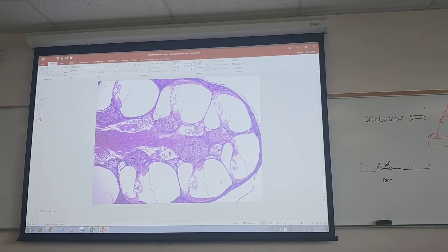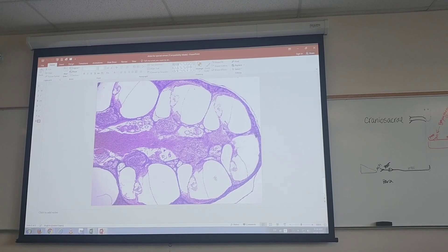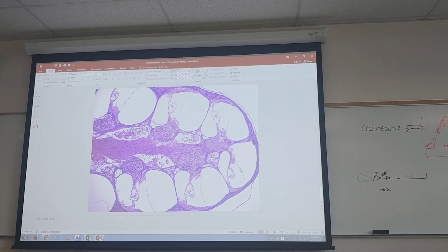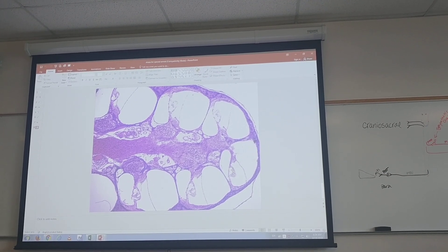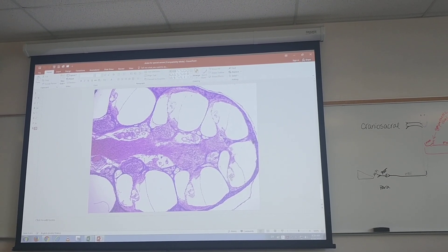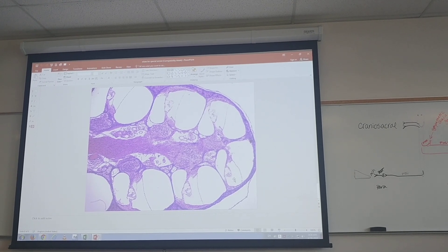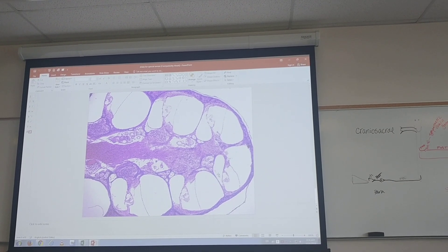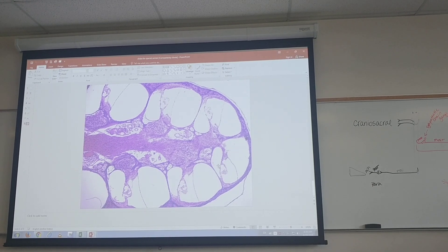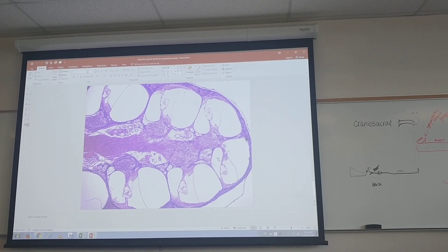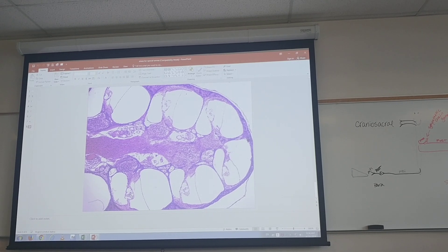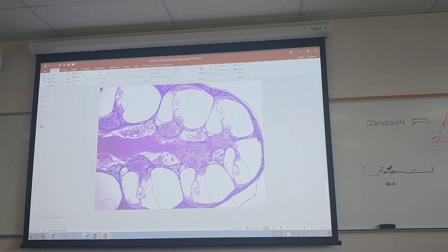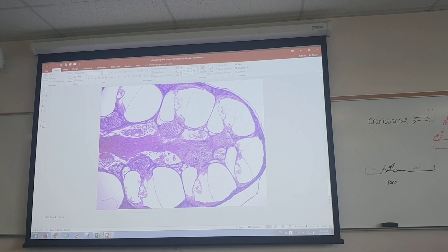Let's do it over here, because sometimes they're big and sometimes they're small. The vestibular membrane is here. Can you see the little spiral organ? Then what does this have to be? That's the cochlear — filled with endolymph. That means up here has to be the vestibular duct, and down below has to be tympanic. On the model it looks like the tympanic is really big, but depending on the cut, that's not always the case. The shape can vary depending on how good the cross-section is.